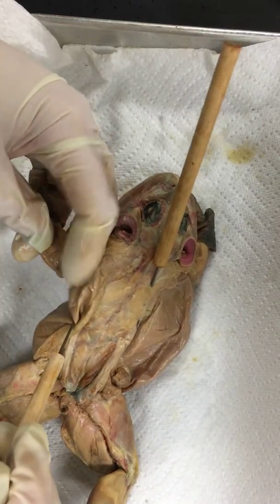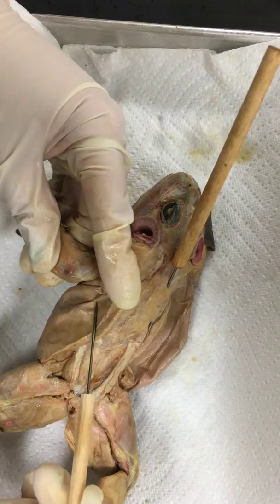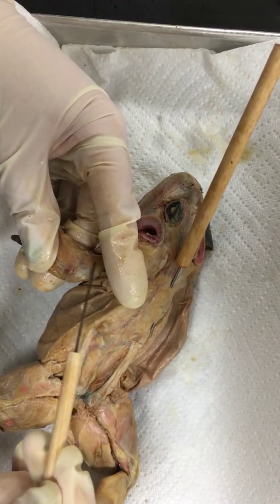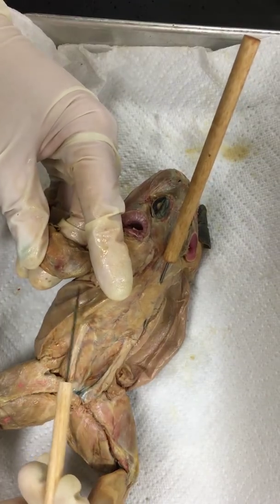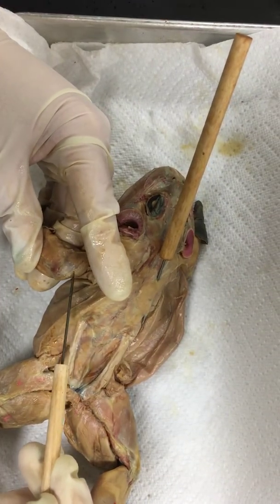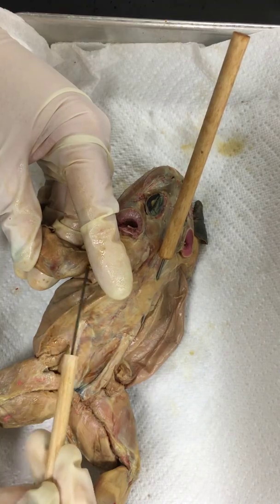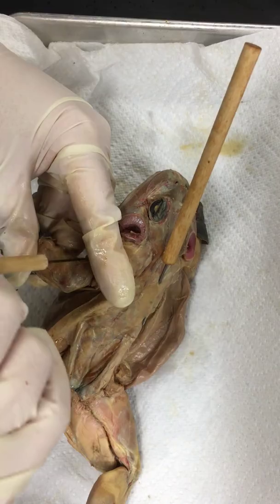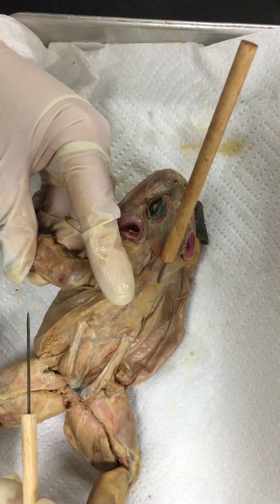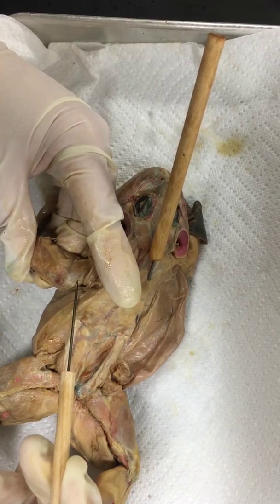Our frog's muscles in his arms and legs — we've got his triceps brachii. Think about your triceps when you go to the gym and lift weights. The ones behind your arm are your triceps. The ones in front where everybody looks at the big bulge — that's the biceps. So here's his triceps brachii.